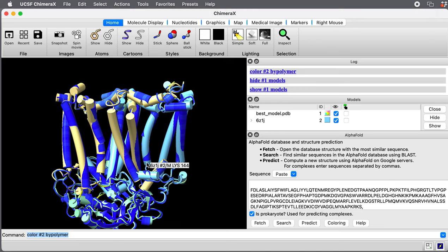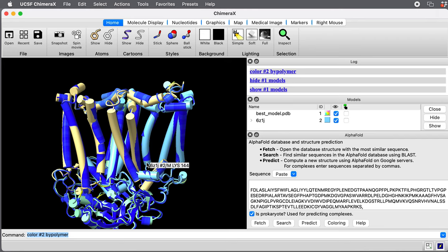Let me mention one additional thing that I don't have to show you right now because it's not ready. AlphaFold predicts the confidence of the distances between every pair of residues. If we show a heat map of that, of the 800 residues against the 800 residues, you will see in cases where it makes a good prediction, the heat map will show high confidence in all those residue distances. But if the interfaces are wrong, you'll see whole blocks of the heat map where the confidence is low.